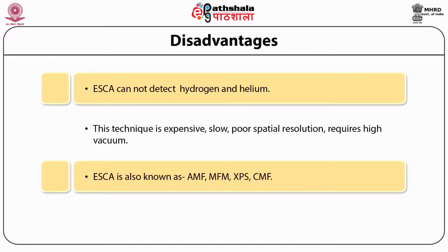For example, if I have nitrogen, sulfur, carbon or arsenic, or any other metal in the thin layer on the surface, one can carry out a very accurate estimation of these. But hydrogen, if it is there, we cannot assess.